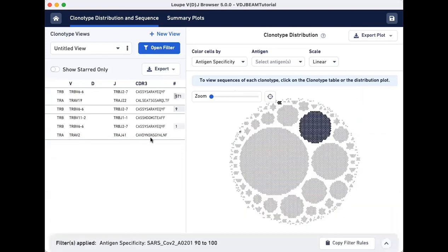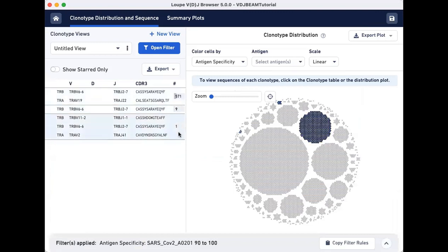Three clonotypes have passed our filter. Two of the remaining clonotypes are small with very few cells.